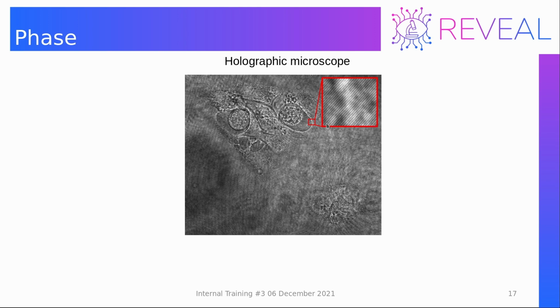Maybe it is not very clearly seen here, but you can trust me that these fringes deviate from straight lines whenever there is some structure, some cellular structure. For example, at this boundary right here, they do deviate from straight lines.